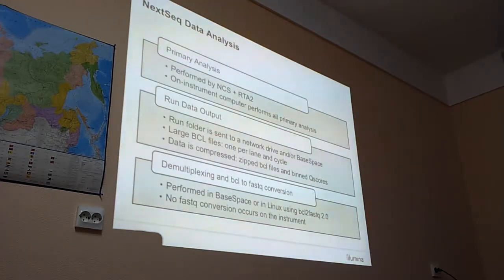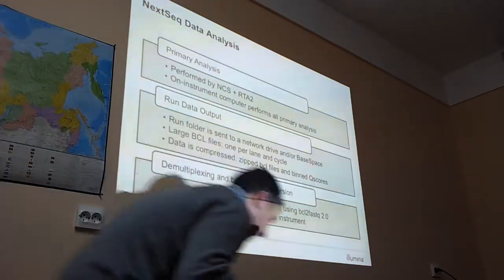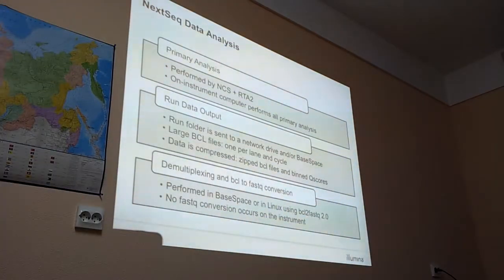Can they analyze the data from the NextSeq as well on the DSO, by somehow loading it on? As far as our plan is, to be honest, I'm not absolutely sure. My information is that at the moment not yet. Our plan is to make it universal for all systems, the DSO, but I think it's not yet ready for this. So at the moment it's only for the NextSeq.